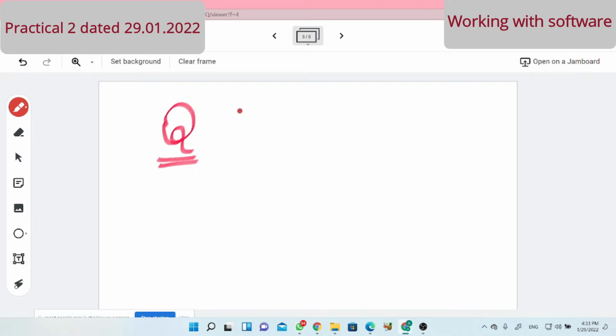It's very important. In that app or software, the Royal Society of Chemistry software regarding titration, they want a burette reading up to 2 decimal points. Suppose here is a large mark and that mark is 17, then small marks are there. Such marks are there in the burette. And if the meniscus is at this level, that is the level of the meniscus.